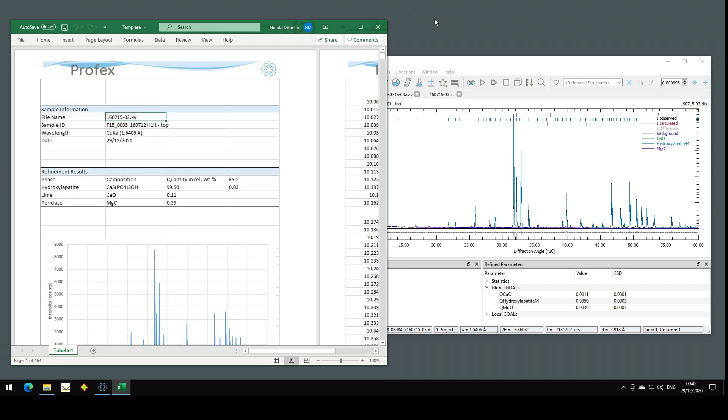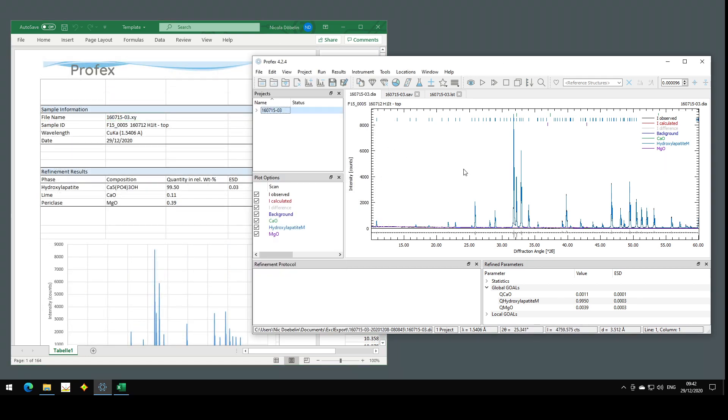I'm going to show you how to set up an Excel export in Profex like this. I will split it into two videos. In the first one I will show the basic configuration, and in a second video I will show some advanced options.